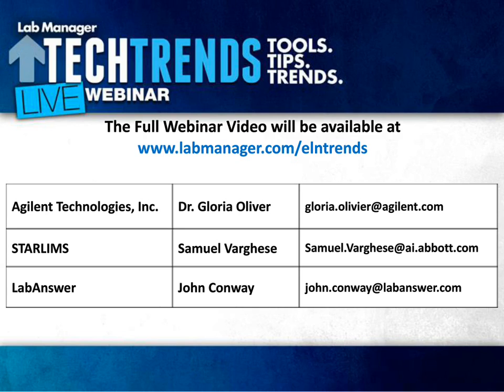Great, thank you. Going forward, do you see a convergence in ELN and LIMS technology, or are these going to stay as distinct entities? This is Gloria Oliver from Agilent. I think absolutely. We're already seeing a convergence of the two. A lot of structured-based LIMS systems are starting to bleed over into the world of ELN and vice versa. I think this is really driven by what our customers need. They need a little bit of both.